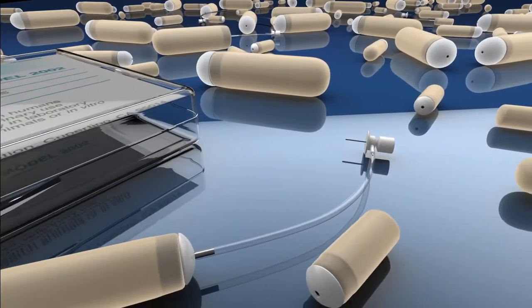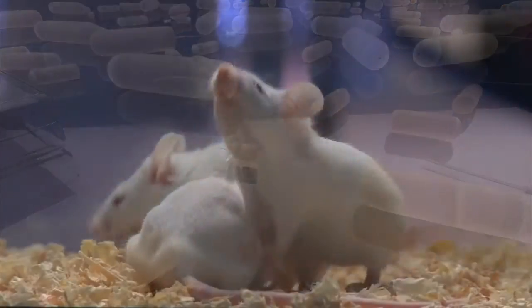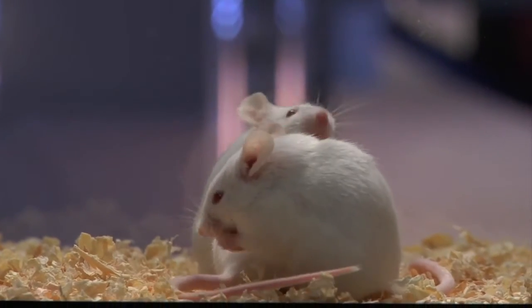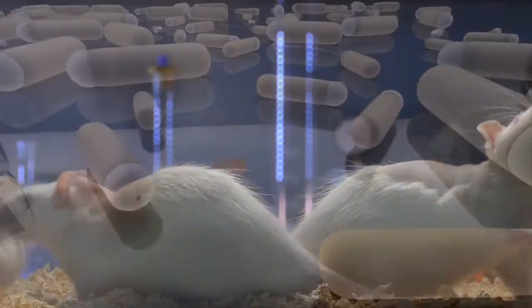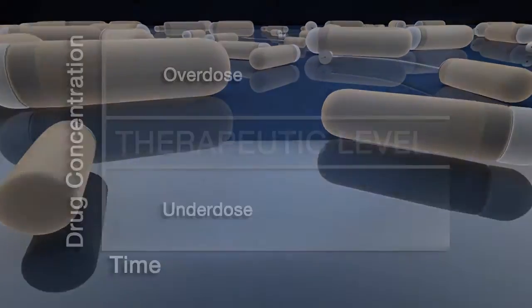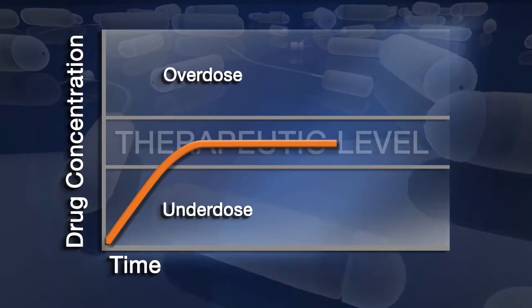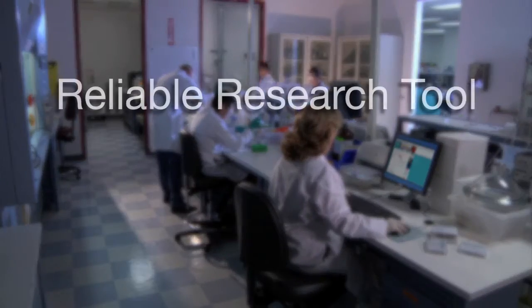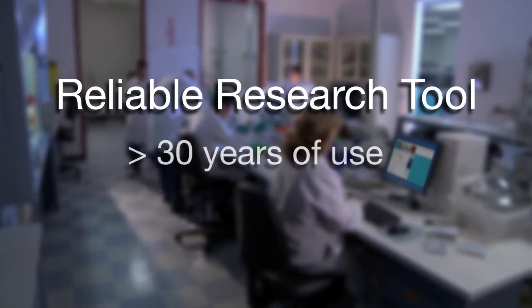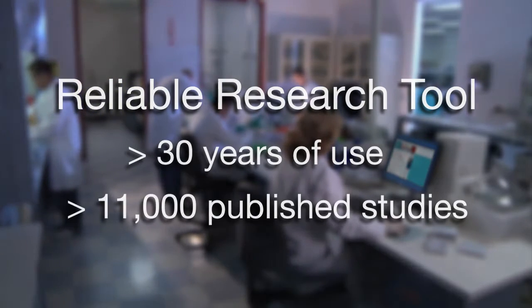ALZ osmotic pumps offer a simple, reliable, and cost-effective solution for continuous and controlled administration of bioactive compounds in unrestrained laboratory animals. These fully implantable pumps provide a convenient method for maintaining constant levels of test agents in plasma and tissue over prolonged periods of time. The proven reliability of ALZ osmotic pumps in research spans more than 30 years and is well documented in over 11,000 published studies.